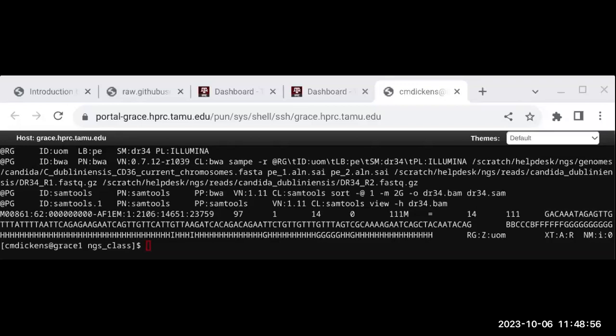It wasn't a duplicate. Duplicate, I think, will be a 0. So this means that the read is paired because it has a 1 in it. It has a 2 in it, so it's properly paired. The mate is on the reverse strand, and this is the first in the pair. Okay, so that's what 99 means. And if you want to use these flags to keep a group of alignments, you can do that, like what we saw on the previous slide.